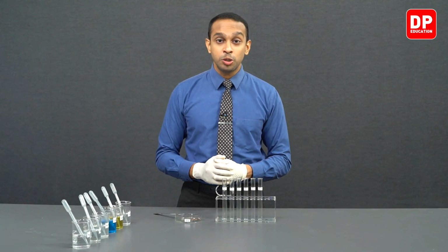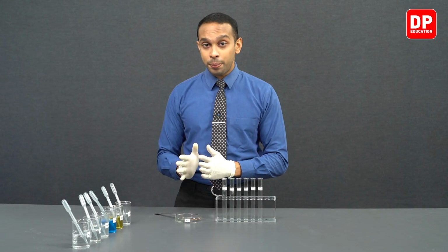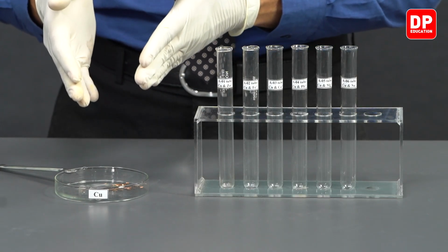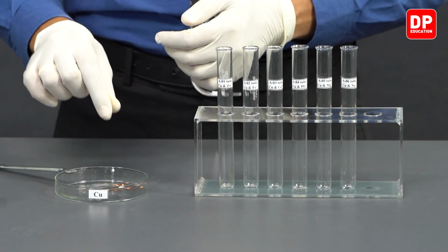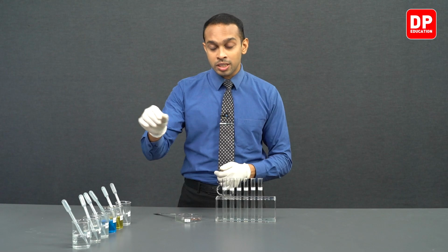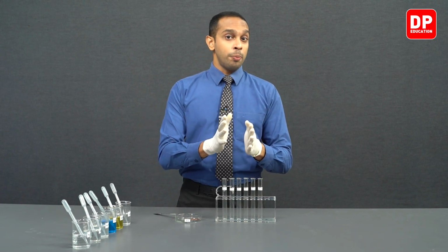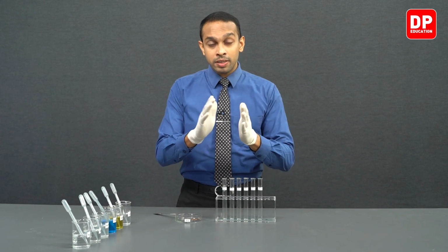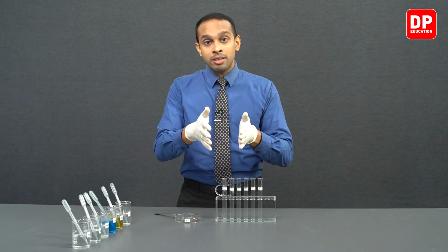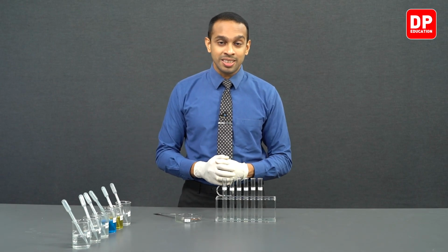Now students, what we are going to do is add the metal copper that we have over here. We have cut pieces of copper metal. So we are going to add cut pieces of this copper metal into each of these solutions, and we are going to observe if copper metal is reactive enough to displace the other metal ions that are present in the aqueous mediums that we have over here.